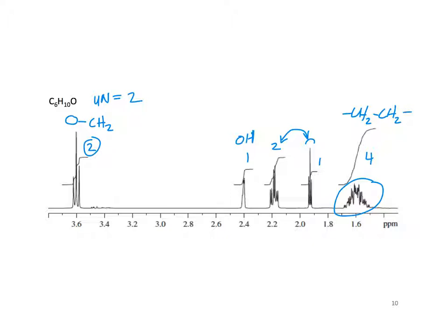Maybe it's a three-member ring, a cyclopropylene. Well, that would only be one unsaturation.